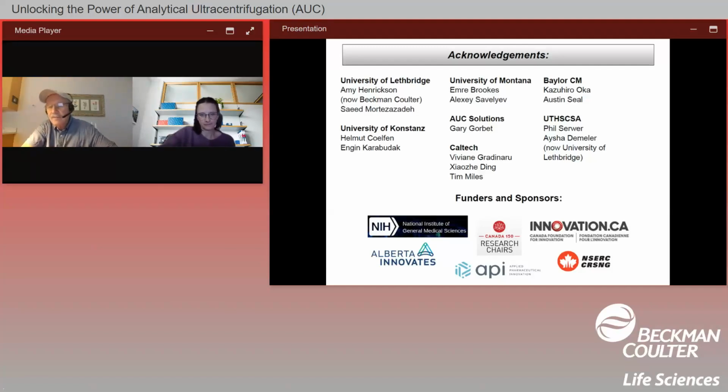Yeah, I mean, the examples that I showed, I think, were already quite convincing on the benefits of multi-wavelengths. It is just a way to add an additional separation dimension to your experiment.